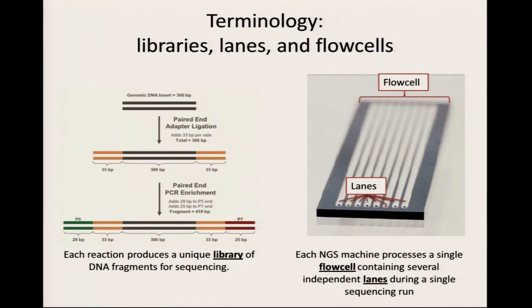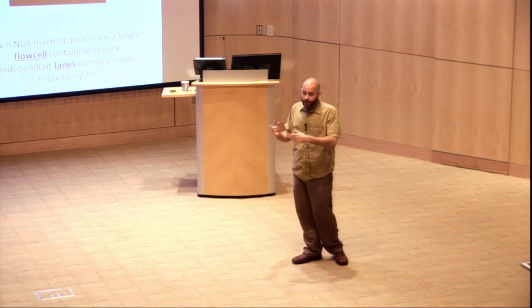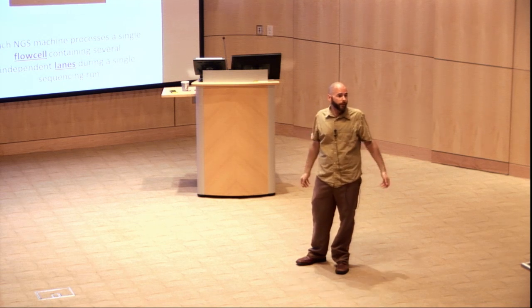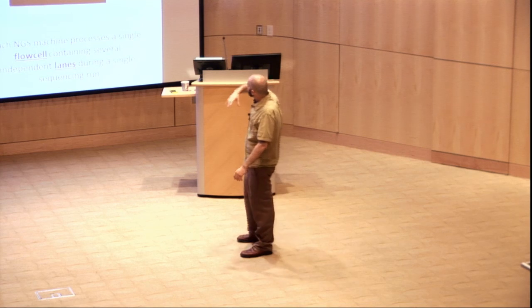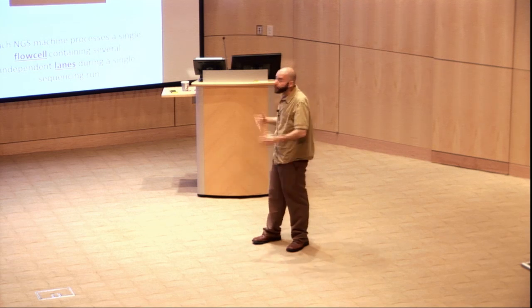Using the GATK and the fancy error modeling that we'll talk about later, we were able to be completely robust to that kind of error because we were capturing that level of covariation of error, right? And so other flow cells adjacent to it were not affected. It was just this one flow cell that had this problem, right? Pretty catastrophic problem.